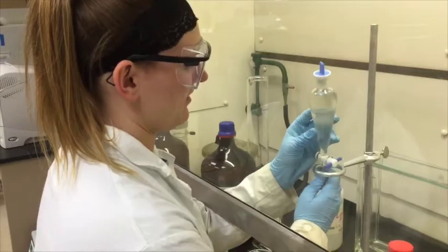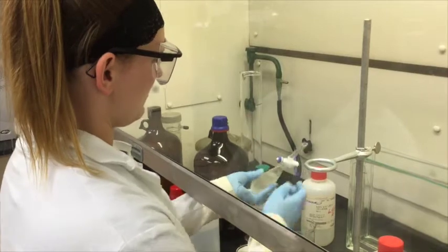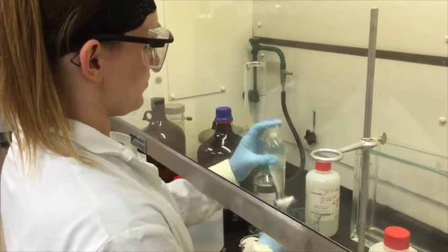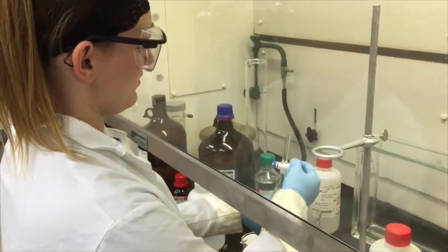A couple practical tips for sep funnels. First, when you're mixing things up, you shake them up real nicely like this, and then you invert it like Becky has, and you burp it. You open it up. That's called burping it, because gas builds up in those things, and solvent can cause things to pop off or spray around.